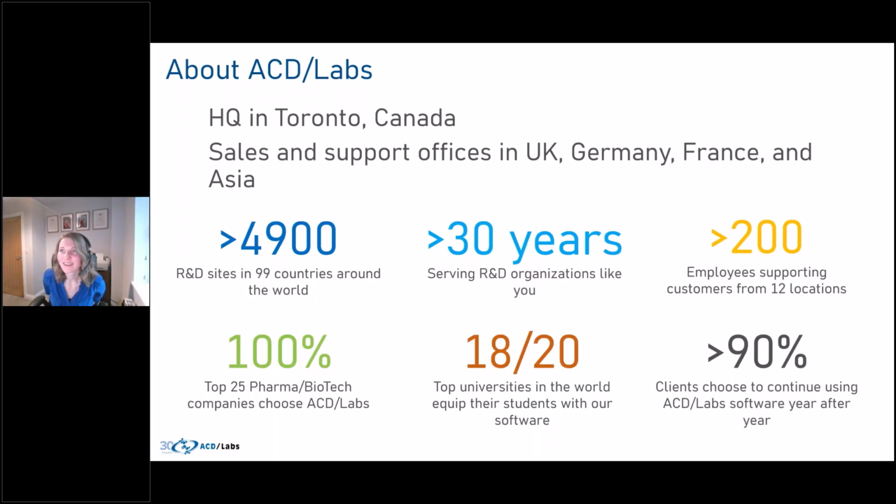So our company, ACDLabs, we are based in Toronto, Canada. We develop software for vendor neutral processing and data management. We help scientists extract answers from analytical data quickly and with confidence, and provide the capabilities for you to share the knowledge with the rest of your organization.